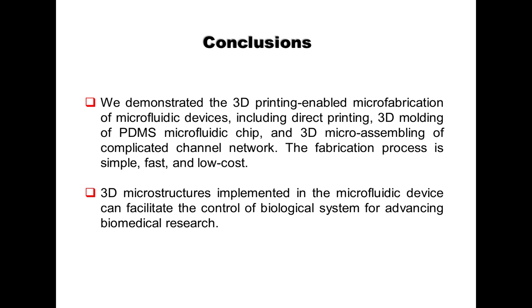So those two examples show the good application of the 3D microfluidics, and we demonstrate that 3D printing enabled microfabrication of the microfluidic device with a three-dimensional microstructure that includes the direct printing and 3D molding of the PDMS microfluidic chip, and also we can use 3D microassembly to create a more complicated channel network.